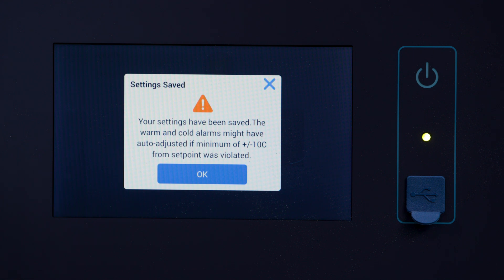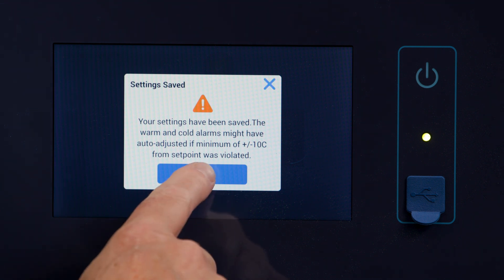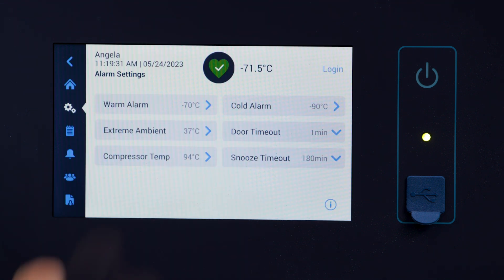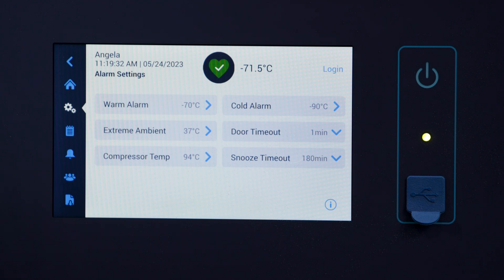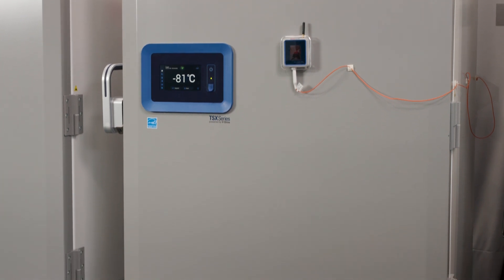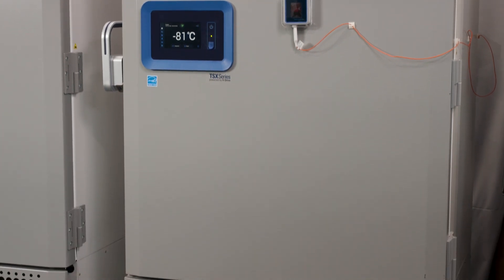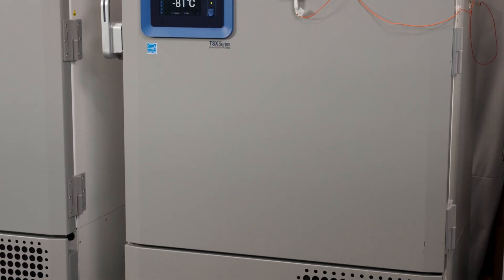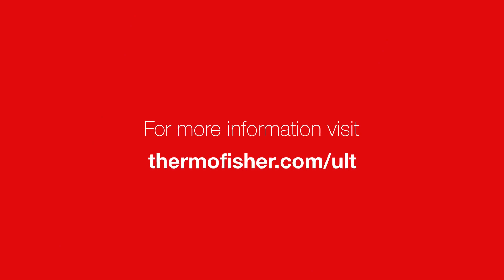With these limits in place, your system will inform you if your freezer reaches a temperature outside of the designated range. And now you know how to add alarm limits to a Thermo Scientific TSX series freezer. It's really that simple.